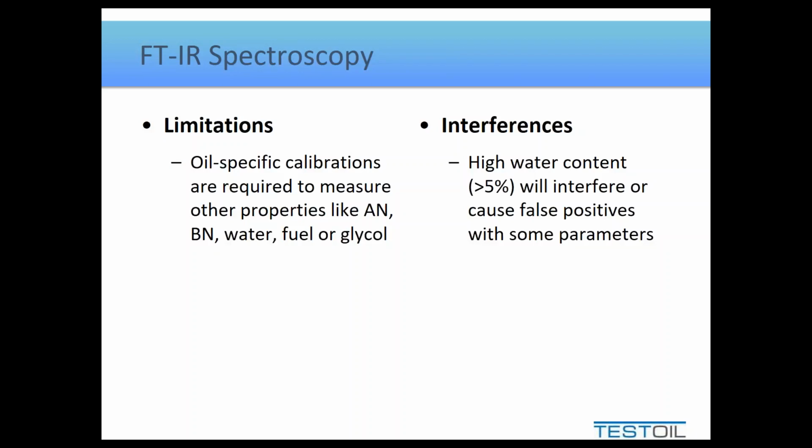In terms of interferences, moisture content plays a significant role in some of the wavelengths that are being measured. Basically, with high water content, you get a giant peak that overlaps a bunch of other peaks and essentially masks them, makes it look like there's a lot more of some things that aren't necessarily there. It's just a giant water peak over top of it. And again, without building a proper calibration, you wouldn't trust the water content necessarily from the FTIR results. You'd rather see it from a Karl Fischer. But these are the known issues with the test. They're not significant. It's a pretty decent test otherwise.